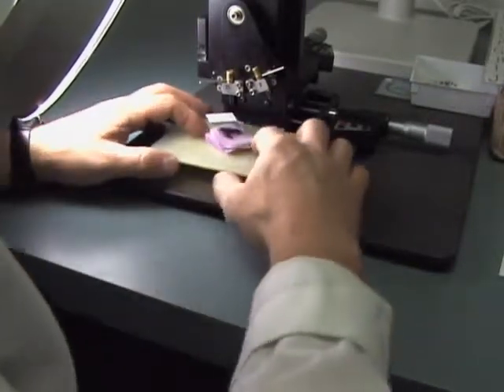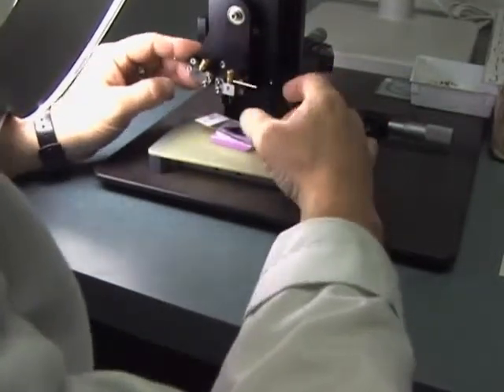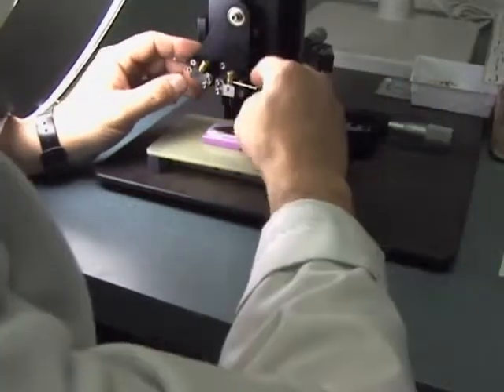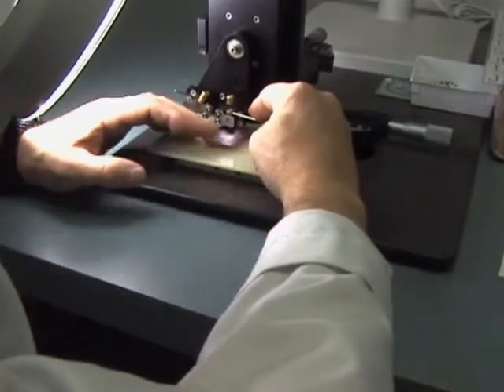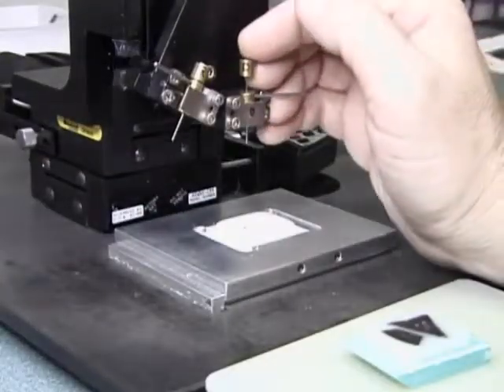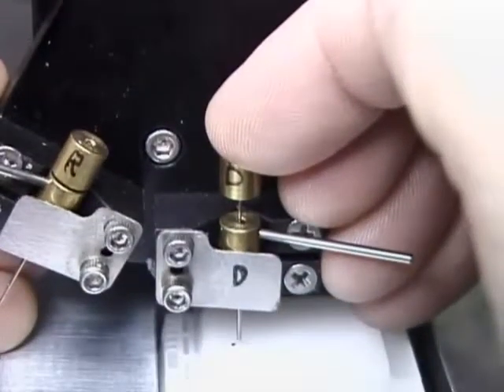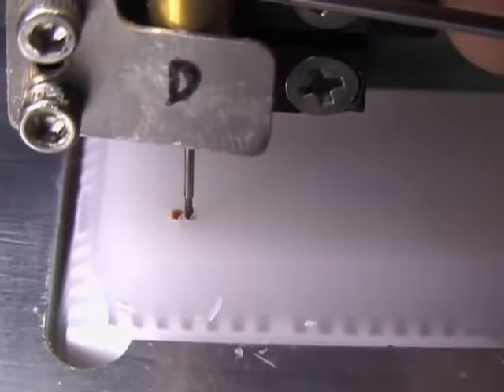It takes anywhere from an hour to 2 hours to punch 100 specimens, so remember to take a break and focus your eyes on something further away. Place your wrist on the arrayer's base plate, then rock your finger slowly to insert a punch. This will steady your hand and give you control when punching.